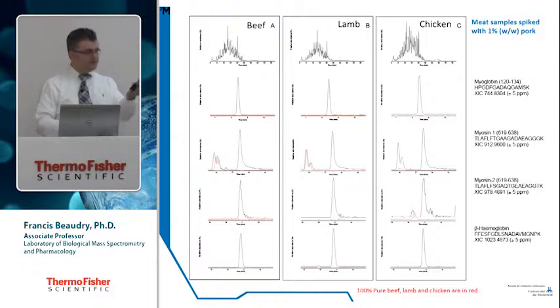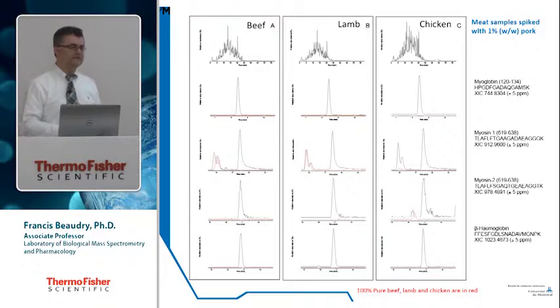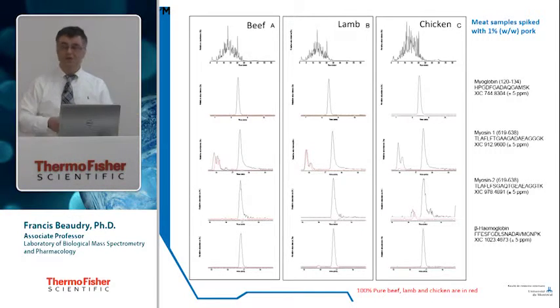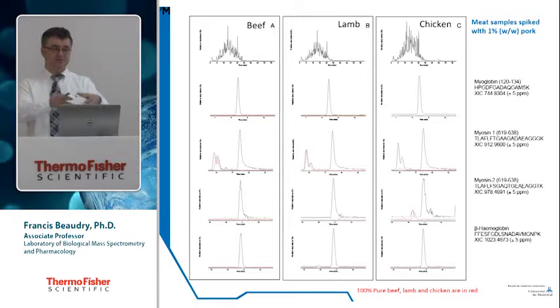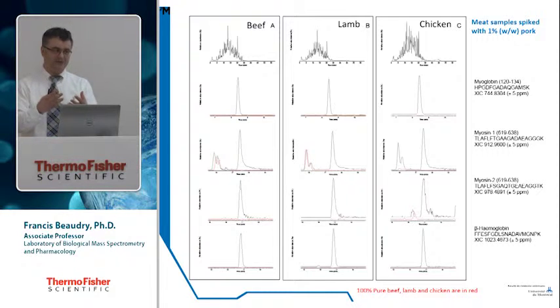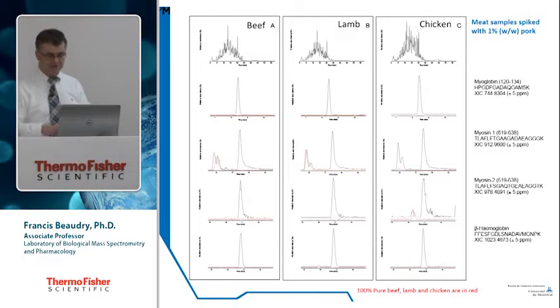Even, and it's related to your question early on, in some cases it's better to work in full scan MS if you can, especially at high resolution, because when you fragment peptides or small molecules, your ion abundance is distributed over the number of fragments you generate. So the more fragments you have, the less ion abundance for each of the fragments. So sometimes it's a trade-off you have to make. It can provide you more selectivity, but maybe less total ion abundance. So sometimes full scan MS will pay off for detection.